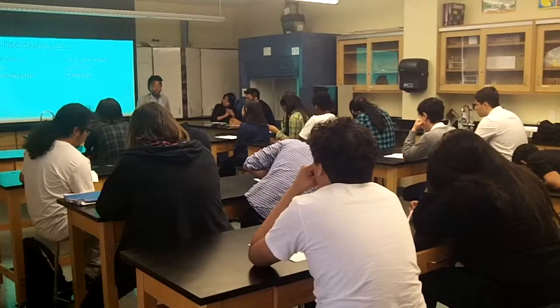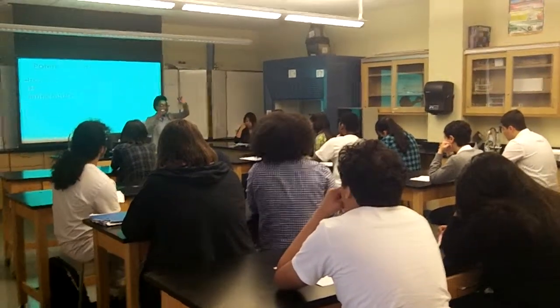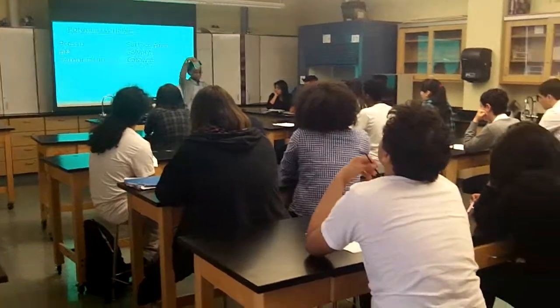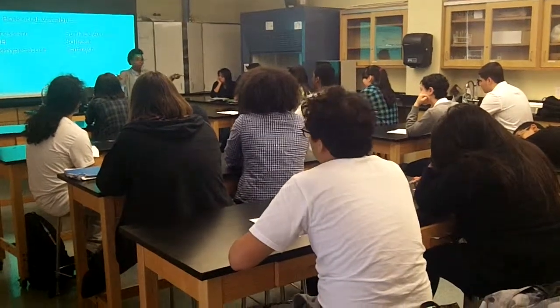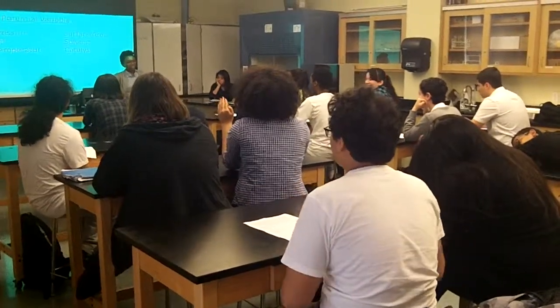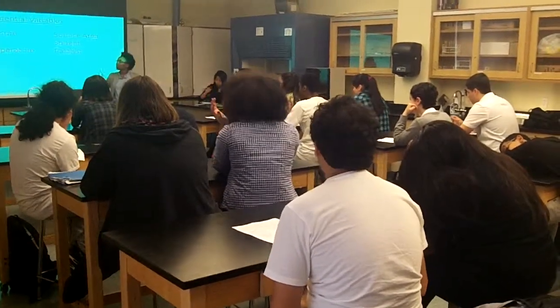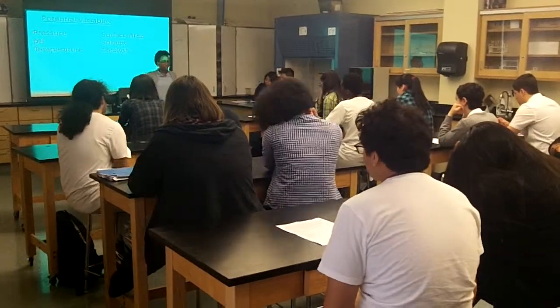These are the supplies that you have for today. We have a timer. We have antacid tablets. We have thermometers. We have beakers. And I am giving you your very own access to water on either side. So, tell me, class, let's have some ideas on which of these variables listed out might we be able to test in today's lab.